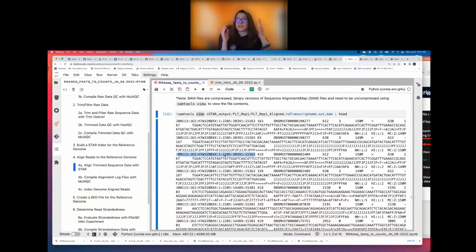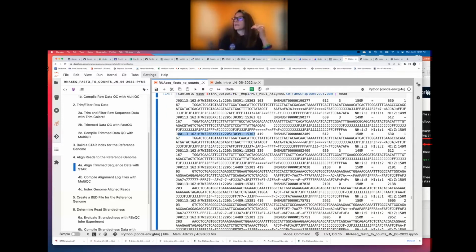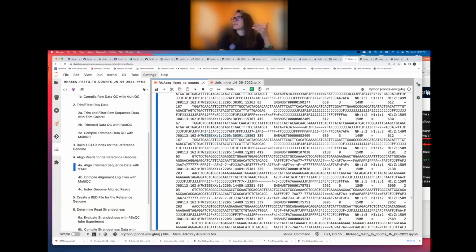So again, same template, still either forward or reverse of that template. And then we have another one here, same exact address, so it's the same insert or template, whatever terminology you want to use. I hear both. That's why I keep using those interchangeably. But again, either forward or reverse. Don't know that yet from here.